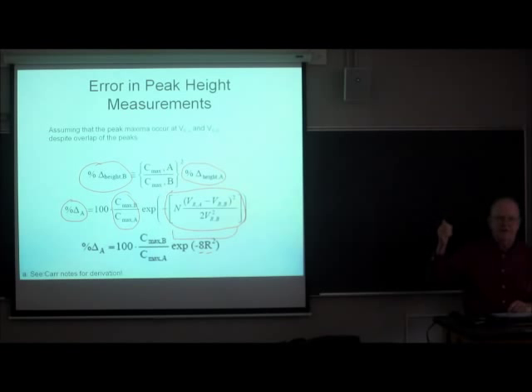And remember in the example I showed in Excel, we doubled the resolution. We went from 0.8 to 1.6, I think. We doubled it, and voila, that second peak, even though it was 16 times smaller, you could see it easily. That's a consequence of this exponential 8r squared dependence. If you put in r twice as big as the previous r, you have an exponential of a negative 4 times bigger exponent. That's a big change in the argument for the exponential, so the error goes way down.